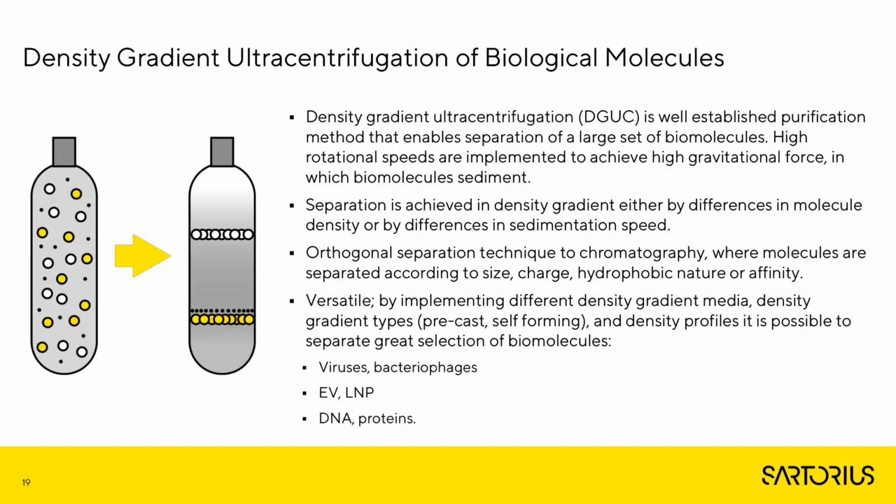The new approach is based on density gradient ultracentrifugation, which is a well-established purification method that enables separation of a large set of biomolecules. When we do ultracentrifugation, high rotational speeds are implemented to achieve high gravitational force, and under the influence of this high gravitational force, the biomolecules sediment.